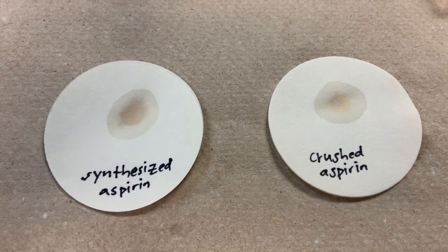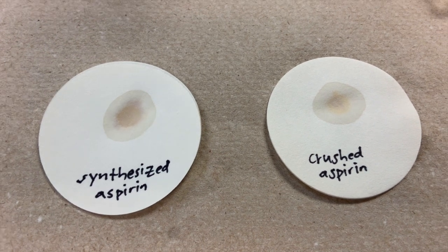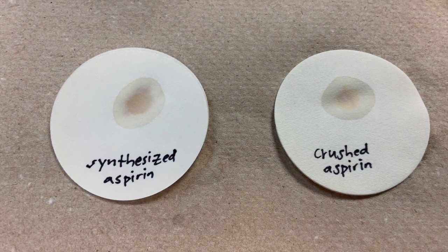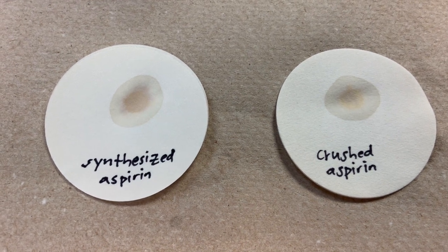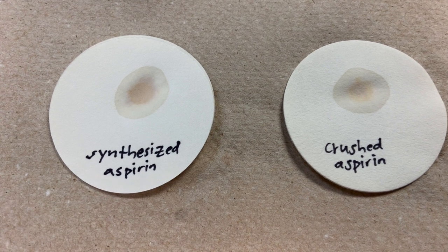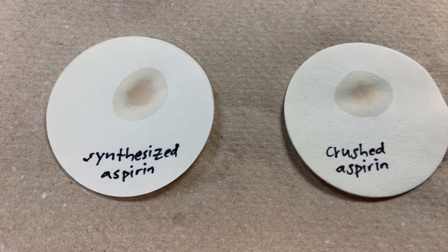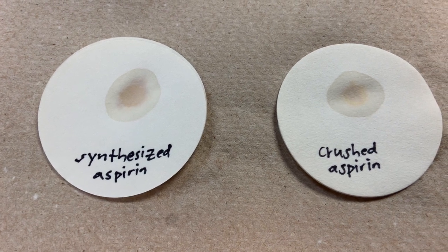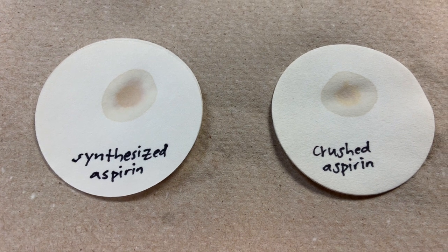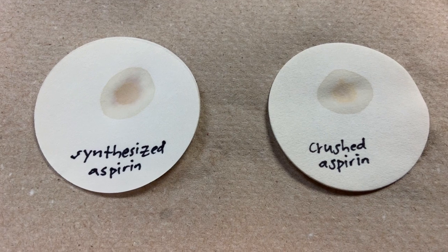So it is not pure. It's giving me a positive result for the phenol test. My crushed aspirin didn't really change, so I know that there is no phenol present in my crushed aspirin sample. So that was the crushed aspirin with acetone, and I applied it to a drop of ferric chloride solution. So my synthesized aspirin is not considered a pure product because there's still salicylic acid present.